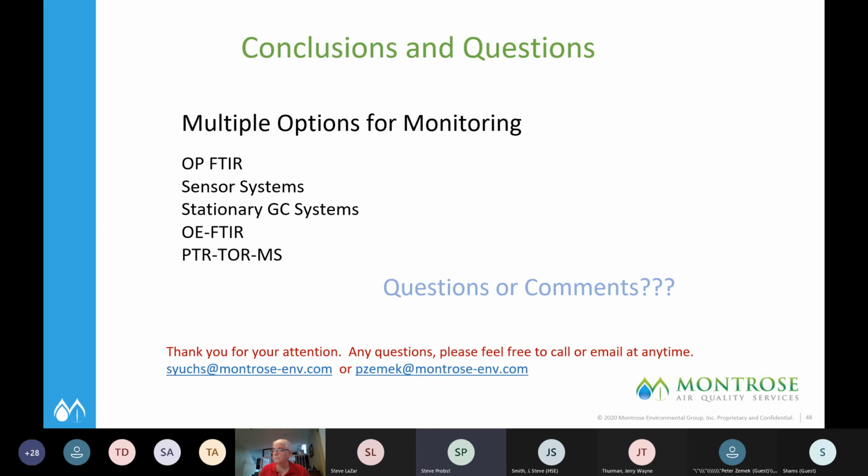Do you assume 100% efficiency of the ionization, and can that be demonstrated? Which ionization? Thomas, if you would like to add some clarity on that question. Yeah, in the proton transfer instrument. No, it's not, and we account for that by using what's called a corrected count area.